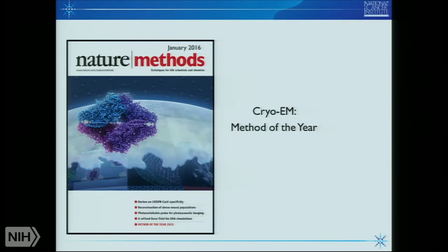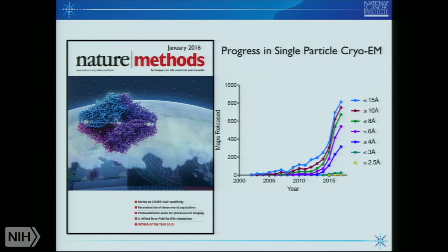Cryo-EM, as many of you know, and maybe the lights could go down a little bit, is now a well-known word. It was labeled as Method of the Year by Nature Methods a couple of years ago, and in the last couple of years, there has been dramatic growth in the field. But I wanted to point out that this is actually not really a new method. Certainly, its impact is seen as being revolutionary, and it is in many respects.